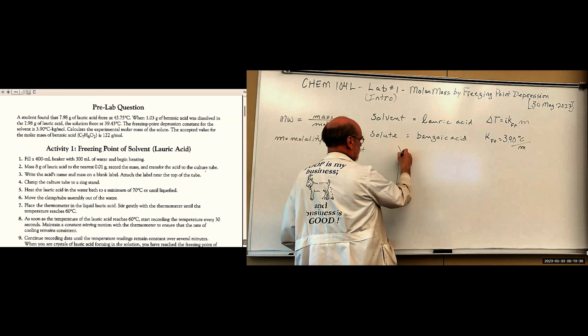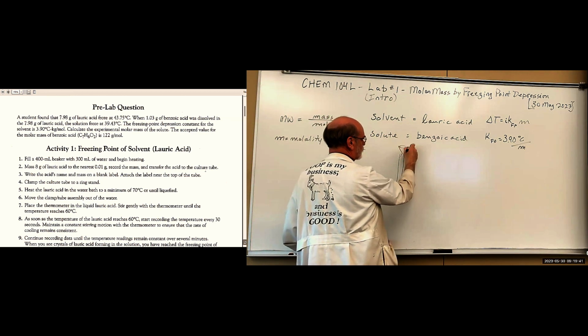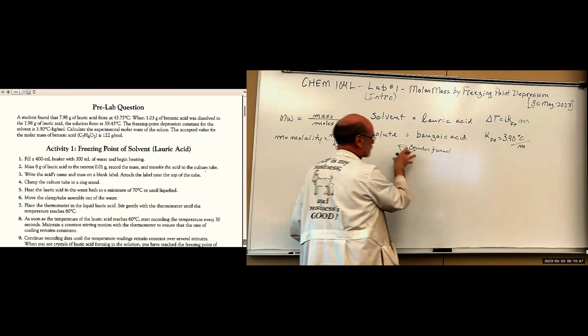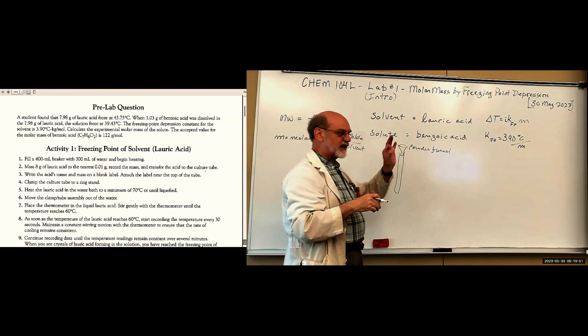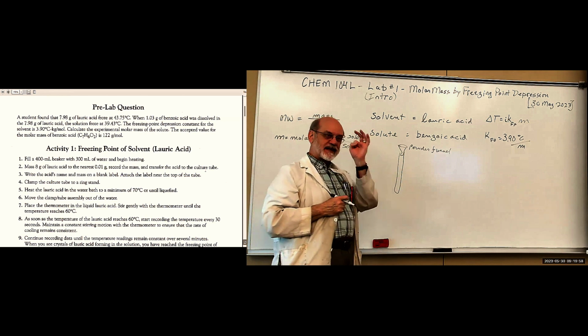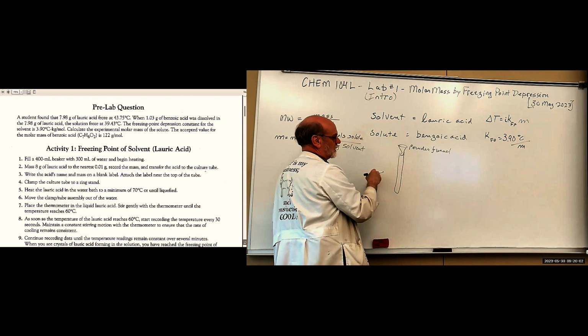And you're going to need a funnel. This is a powder funnel. The only difference between a powder funnel and the funnel you've been used to is it's got a big opening, right? Because we're going to put solid through there, and if we use one of those really tiny ones, it would get clogged up. So we use a powder funnel.